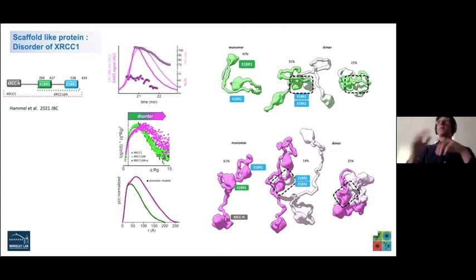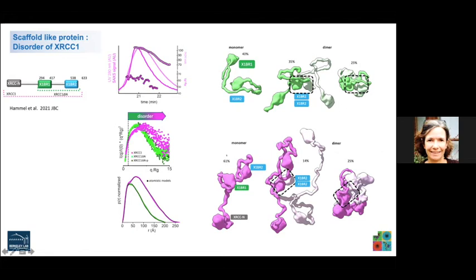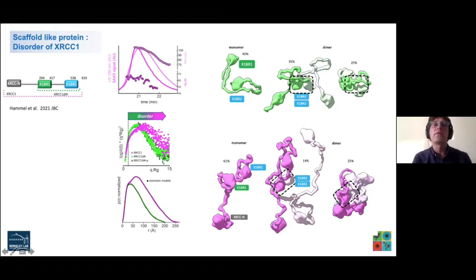I think during COVID, with what we did with SAXS, a relatively simple technique, it was very useful for companies as well to apply this technique for screening, developing, and checking stability. So yes, you are okay to send us your Superose 6, and we will try our best. If 1.5 megadalton is not enough, Alim has some suggestions. Alim? Okay, you need something other than SEC for separation. That's right.